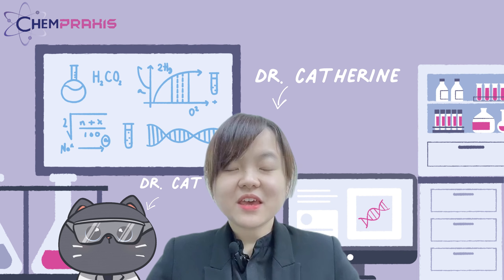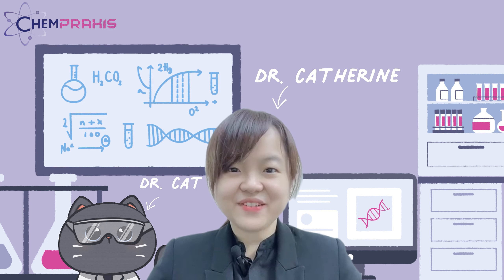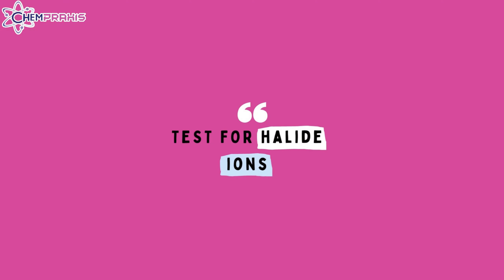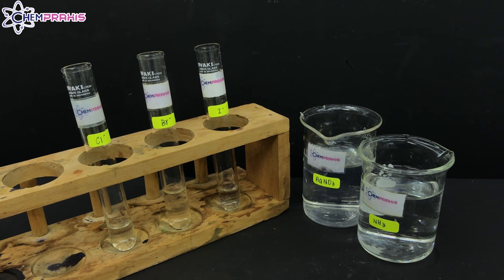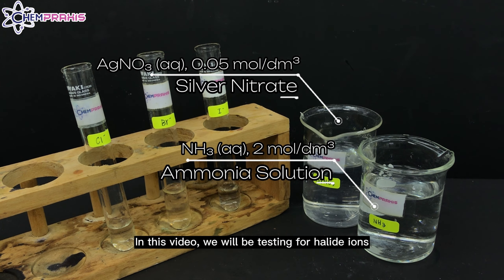Hi, I'm Dr. Catherine. ChemPraxis is a science specialized center for IGCSE and A-level. Let's start our experiment now. Hello, we are from ChemPraxis. In this video, we will be testing for halide ions using silver nitrate and ammonia solution.